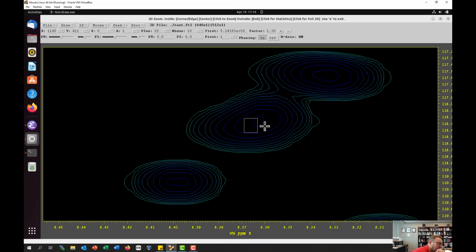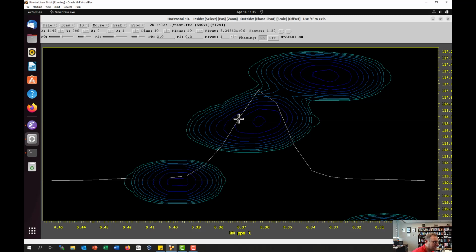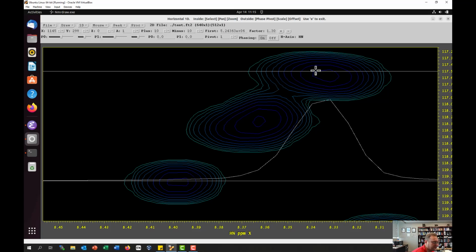Okay, so notice that in the contours you're not actually seeing a big difference. But notice that you're starting to see a little bit of blockiness here, right? And if I type exit and put myself in horizontal mode, if I look at that peak, you can definitely tell that is not a smooth peak. If I were trying to estimate the maximum of this peak, and I were to put a smooth curve through all these points, probably the maximum is like here. But the maximum value I would actually get would either be this or this, because that's what's actually in the data.